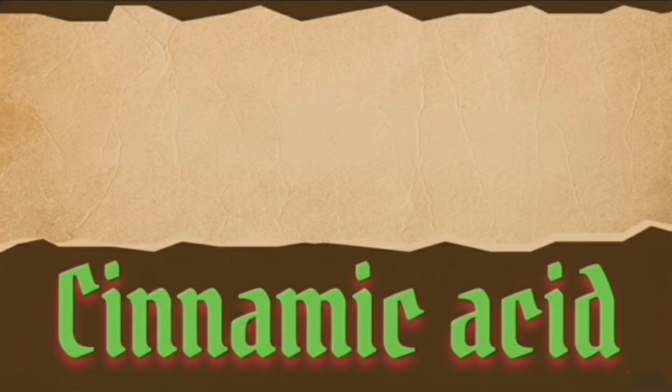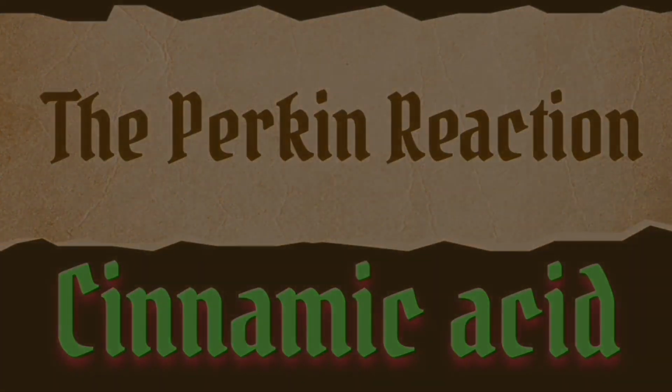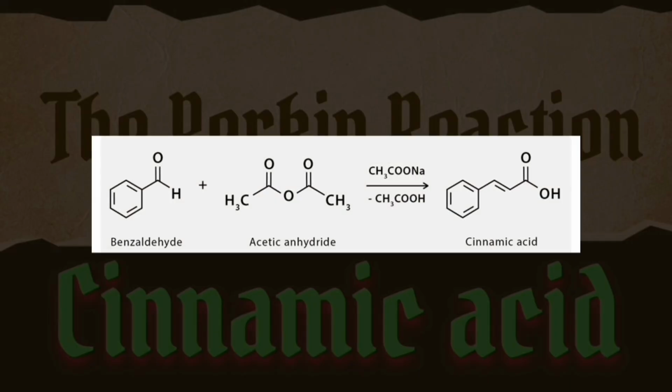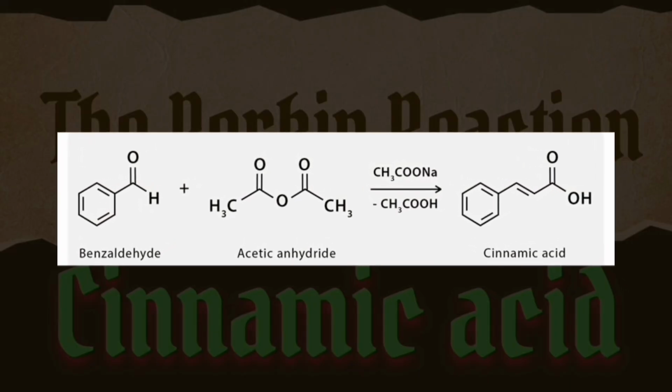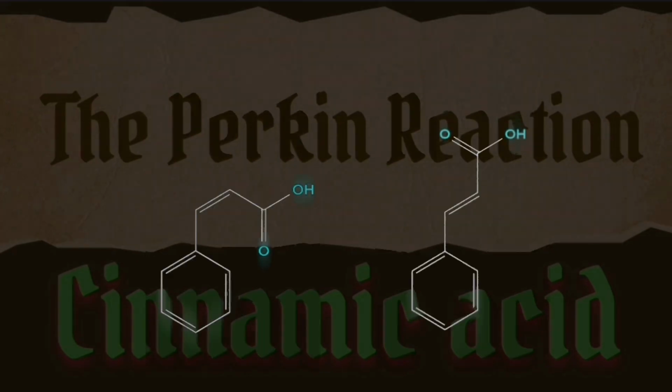The old way of making this was via the Perkin reaction, described in 1877. This method consisted of heating benzaldehyde with acetic anhydride in the presence of an alkali salt like sodium acetate. The disadvantage of this method is that it requires higher temperatures, longer reaction times, it's non-stereoselective, and it has a tendency for unwanted side reactions, resulting in lower yield.